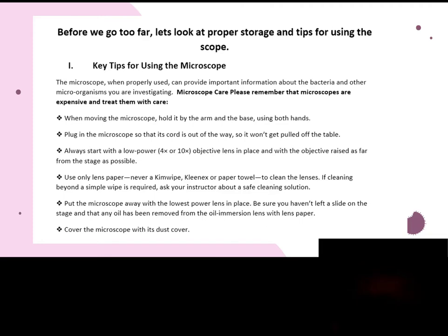We use lens paper to clean the lens — never Kleenex or paper towels, which can scratch lenses. There's specialized lens paper that is a very fine linen and will not scratch. We always put the microscope away in the ready position: stage all the way down, set back to 4x. The person who uses the scope after you should not be able to tell you used it. It should not be left in disarray with oil on it or on some other objective.